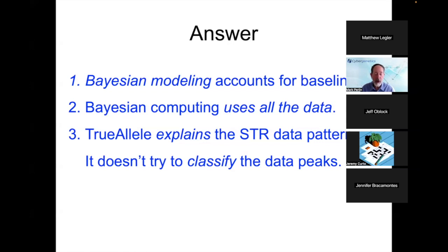But TrueAllele is trying out 100,000 different explanations at every locus. Those explanations include to what extent the system says, well, this pattern that it's trying out against the data as a model, maybe that is in the allelic pattern, maybe that isn't. So it's explaining the data without changing it, which is what any Bayesian program does.